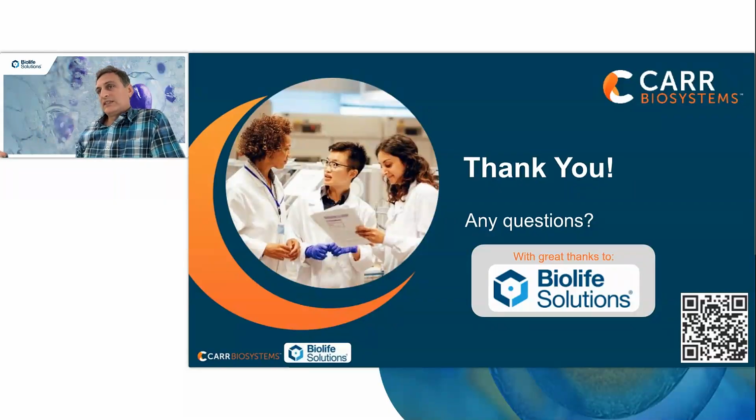One thing that we tested in this was we used the CryoStor base and also CryoStor CS5, to not only eliminate that manual step after reformulation or buffer exchange, but also have the ability to really adjust what that final concentration of DMSO would be at the lowest volume that you can get with the elution volume of the instrument, up to 10% using CS10. In this case, we used CS5, but it's also possible to do that with CS10.